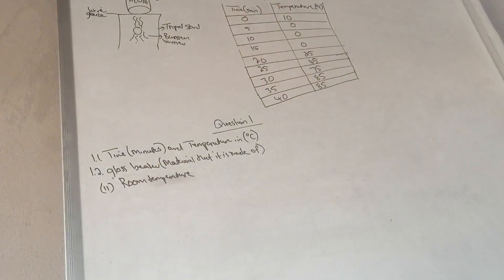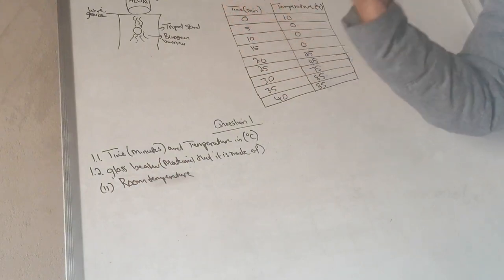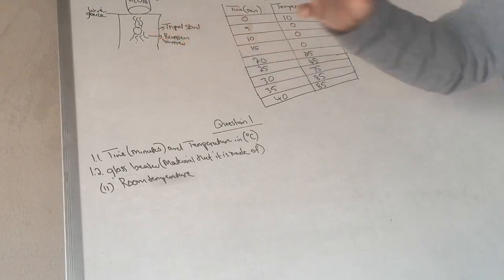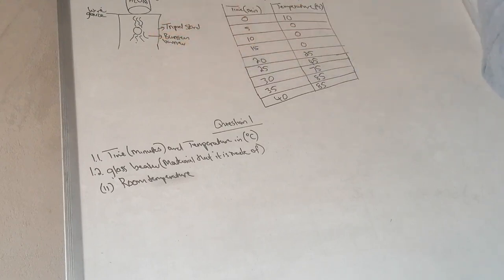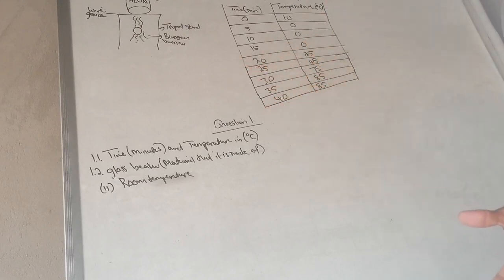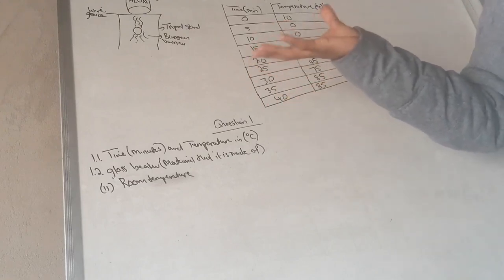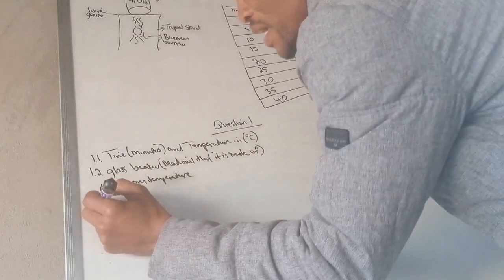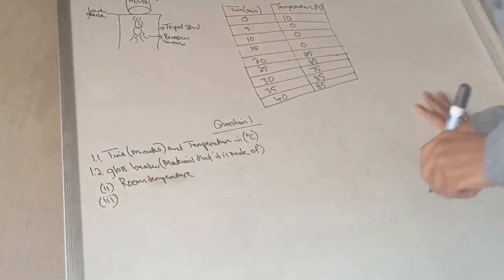Because why are we saying that? As the Bunsen burner burns, remember, the average kinetic energy of the particles inside of the room will also have a major impact on this. If the room temperature is maybe a standard 25 degrees Celsius, that's fine. But what if the experiment was conducted on a very cold day? That could also have an impact on this. So the room temperature also plays a significant role. What other thing do you think might have influenced our results? What else?